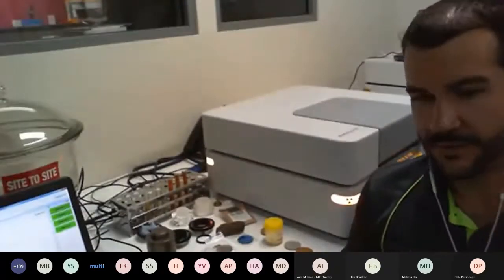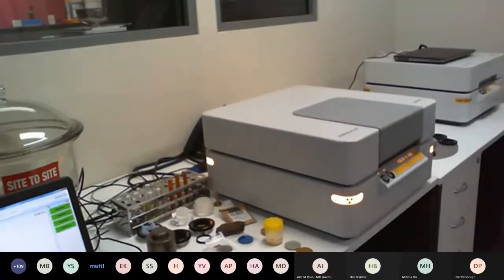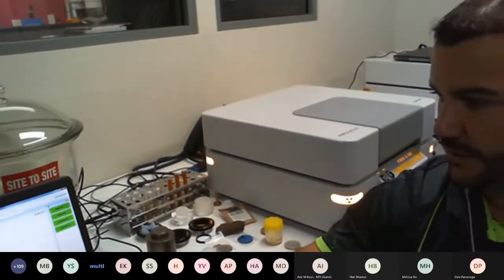So the analysis didn't take as long as my presentation did. It was over and done quite quickly in the first 90 seconds, and we've now, on the right-hand side of the screen, our result is available.